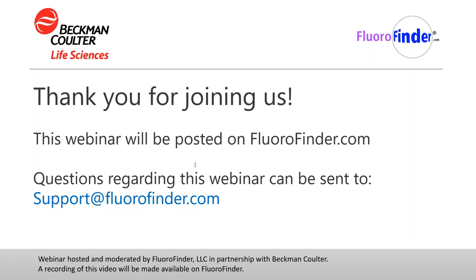Okay, great. And then there was a follow-up question here. Someone was asking, in the case that I want to use another molecule, can I add another antibody during the first incubation? So you mean if it is another staining reagent, so another staining molecule, that would be, I believe, the question. If so, during the incubation, you can add a variety of staining. You just have to make sure that the antigen you're looking at is compatible with the fix and lyse approach that is being used. But yes, creativity here is permitted for sure.